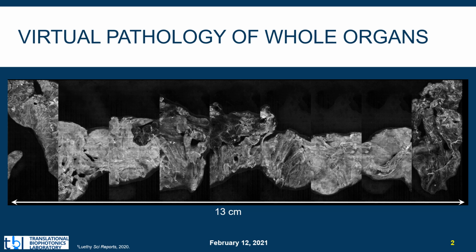As our current SIM system is based on optical sectioning, we think that incorporating super-resolution, not for imaging smaller details but for resolution recovery that occurs with lower magnification, lower NA objectives, can help us with space bandwidth product limitations.